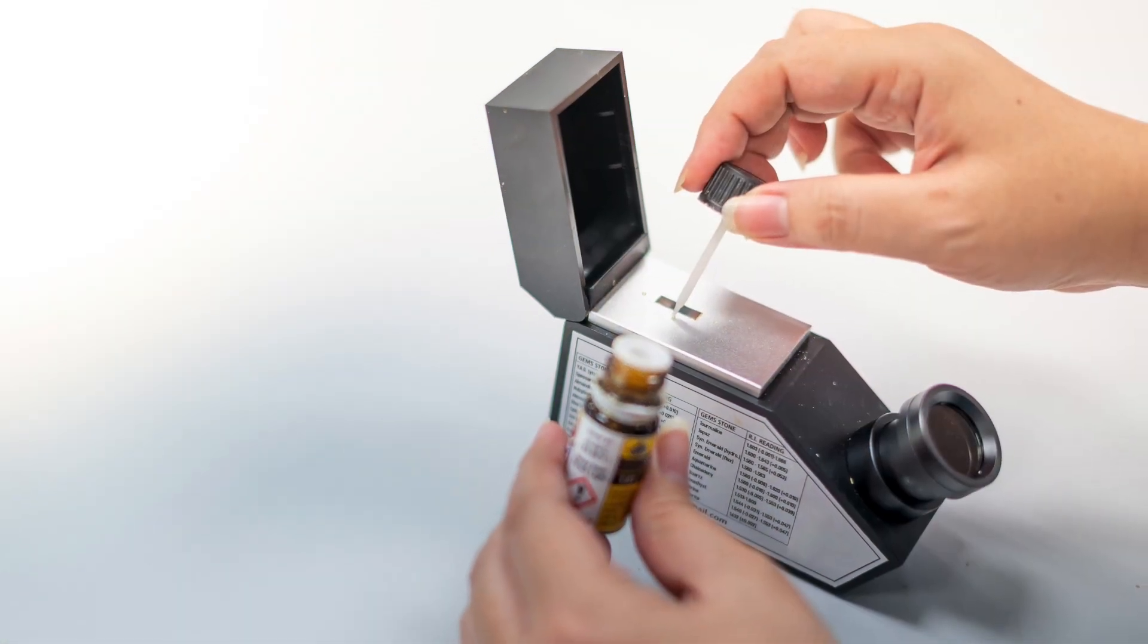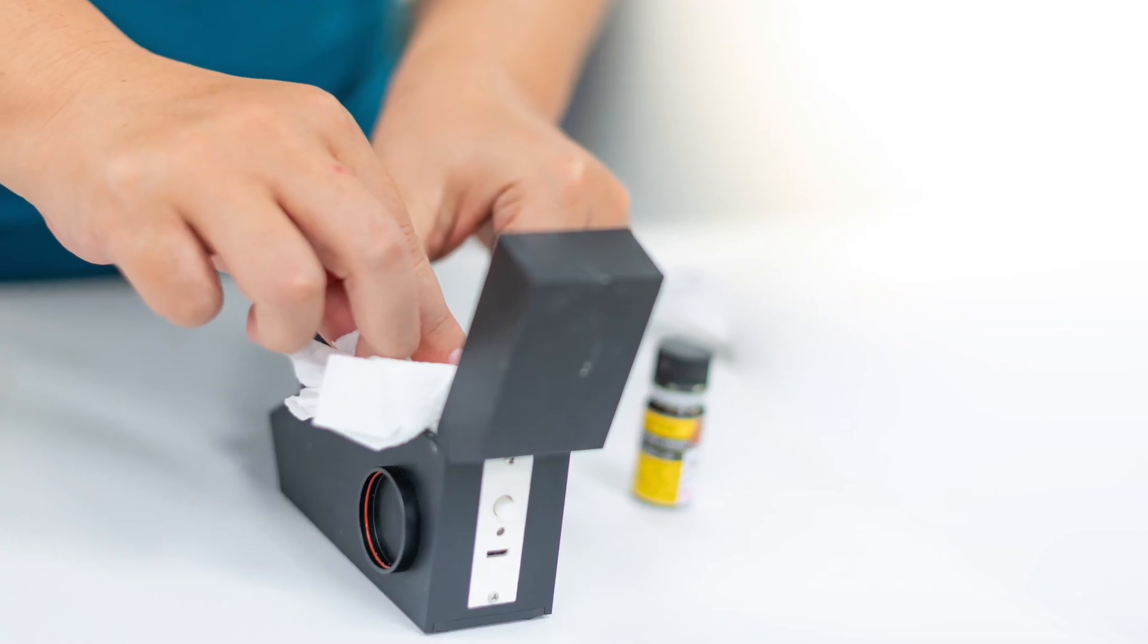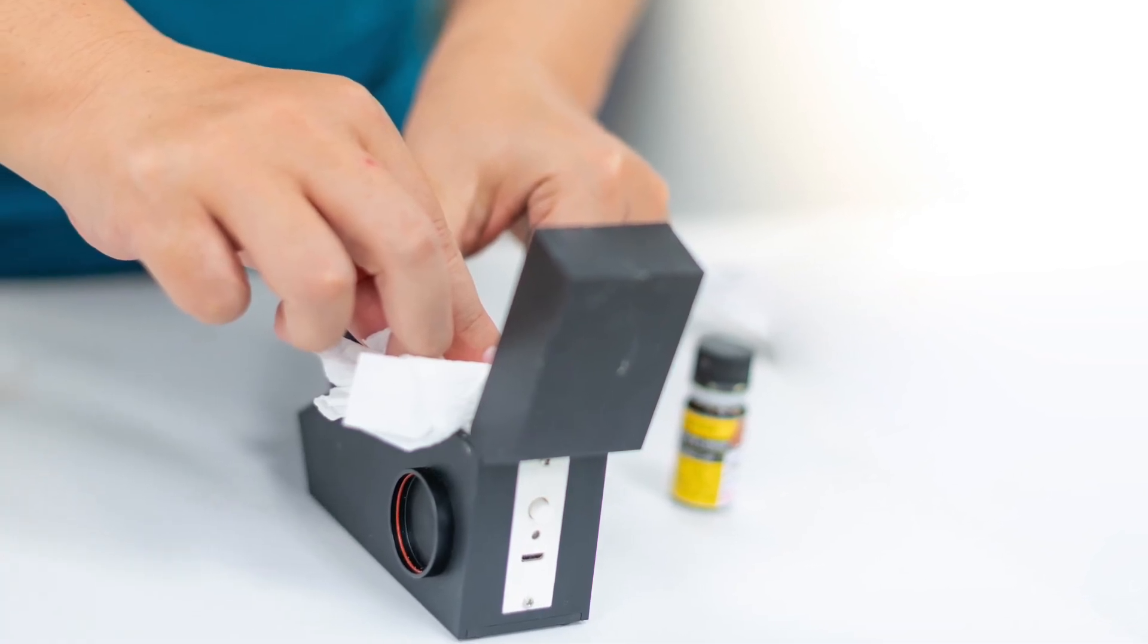Benchtop refractometers are more expensive. However, a single unit can typically be used to measure degrees bricks across the entire range of possible values.